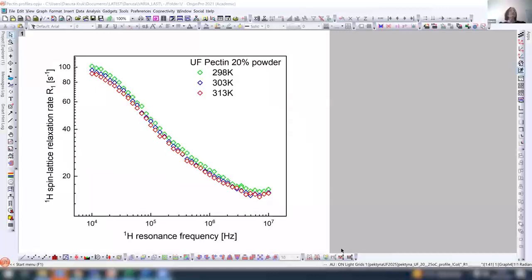But then we tried to explain it with an effect which was called dipolar relaxation enhancement. We were saying that there are residual dipolar interactions. But then the residual dipolar interactions, to get such effects, have to be comparable with the Zeeman coupling. And of course, the residual dipolar coupling cannot be very large. So if you observe it at low field, it might be so, but definitely not at high field. Okay, but we got this thing. Now, the first thing which I would try is to take one of them.